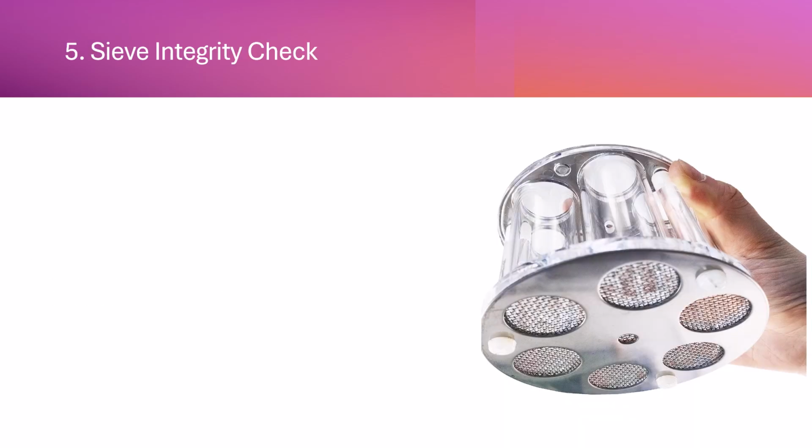So now next is the sieve integrity check. The purpose is to verify the physical integrity of the sieve baskets, ensuring they maintain the correct mesh structure, which is critical for consistent disintegration testing. So let's start with the procedure.